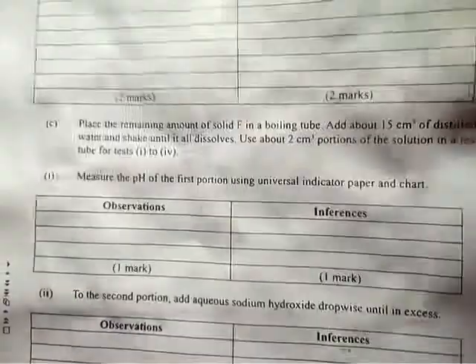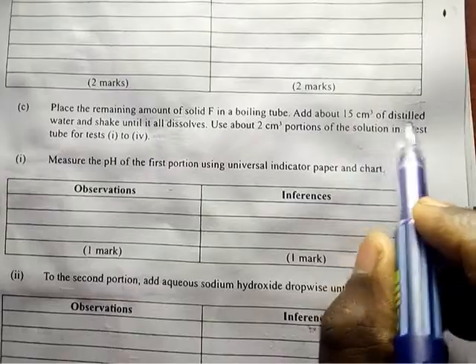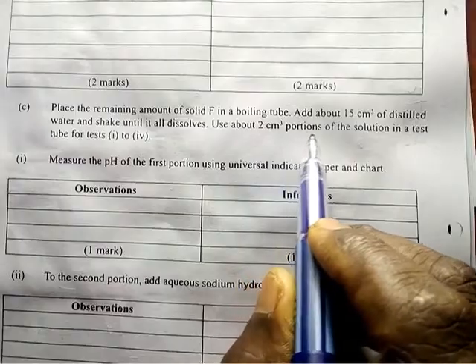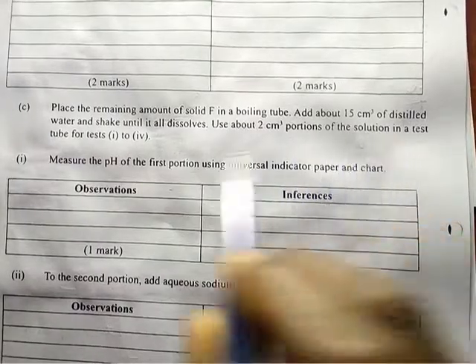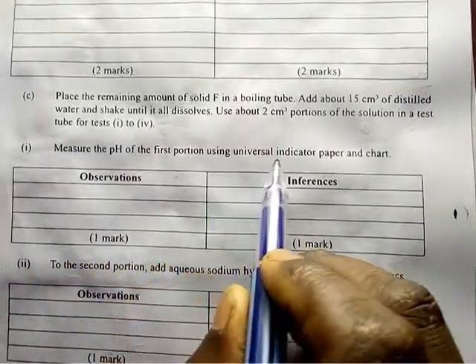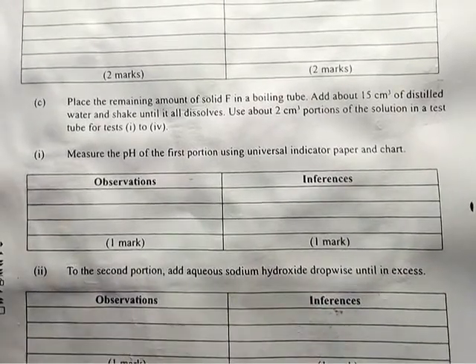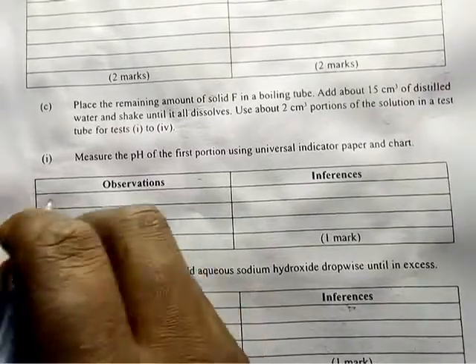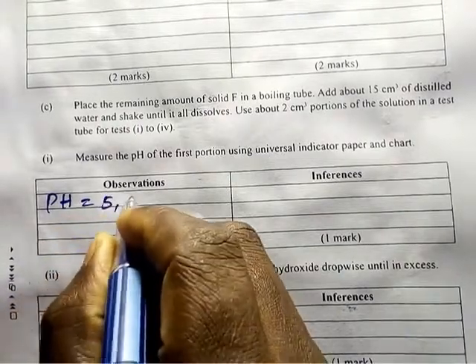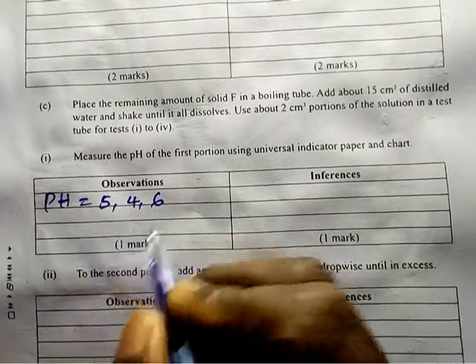Place the remaining amount of solid F in a boiling tube. Add about 15 centimeters cubed of distilled water and shake until it all dissolves. Use about 2 centimeters cubed portions of the solution in a test tube for tests 1 to 4. Measure the pH of the first portion using universal indicator paper and a chart. So here the pH was 5 to 6. They allowed a pH equal to 5, 4, or 6. Any student who wrote 5, 4, or 6 got the answer.